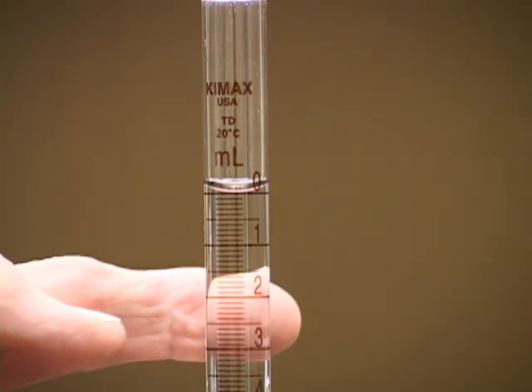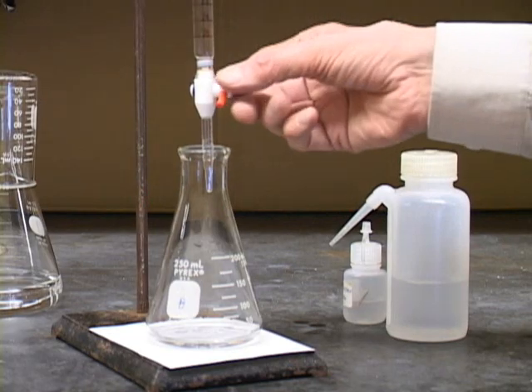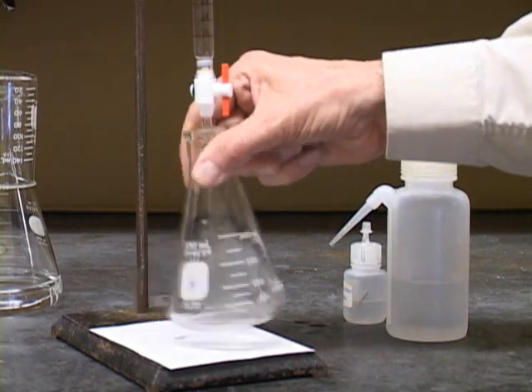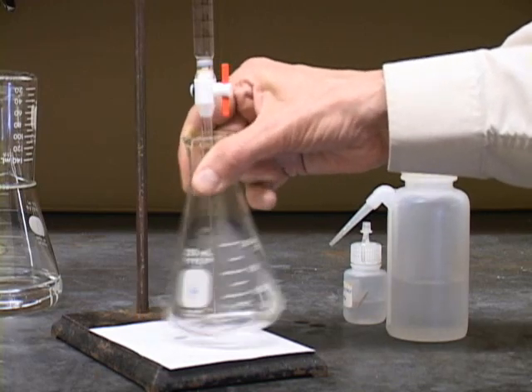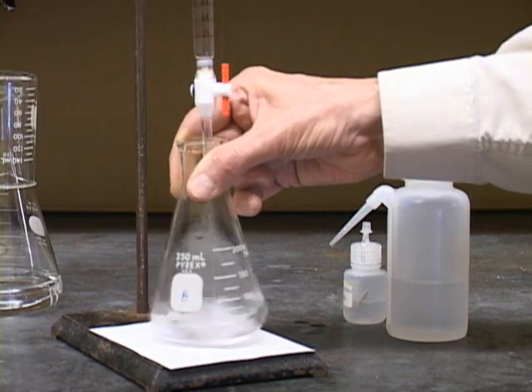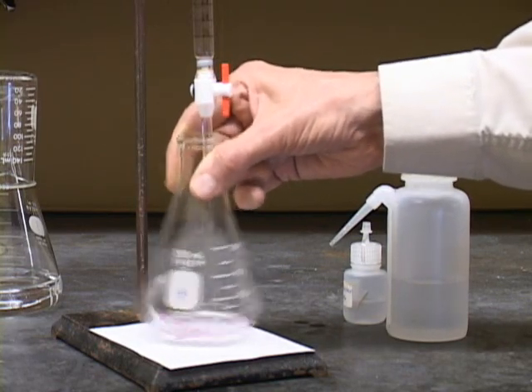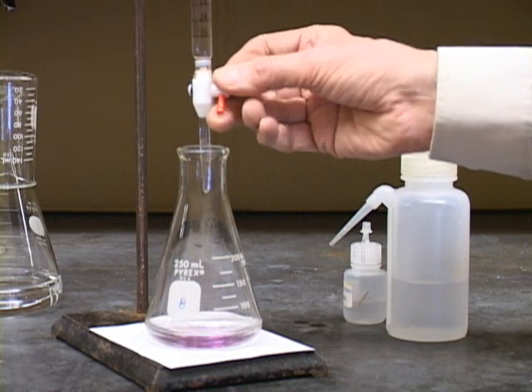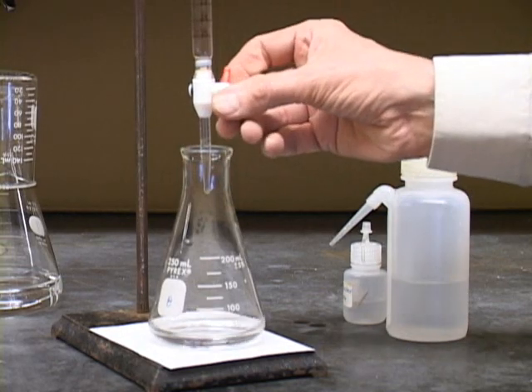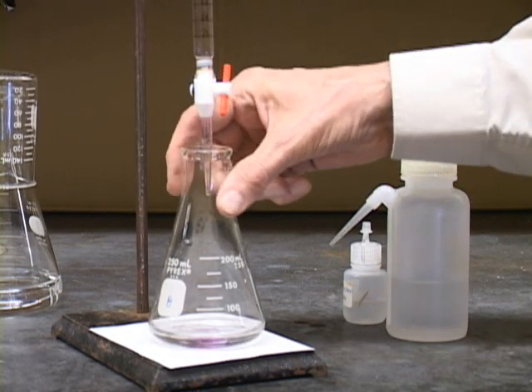The initial reading is 0.00. We can now start adding the sodium hydroxide. We'll add it fairly rapidly at first, but we need to do that with lots of swirling here so it gets mixed thoroughly. And as you can see, there's just a faint pink spot being formed even now. We'll get a bigger pink spot there, so I think we'll slow this down. And now we'll add it only dropwise. Drop, drop.